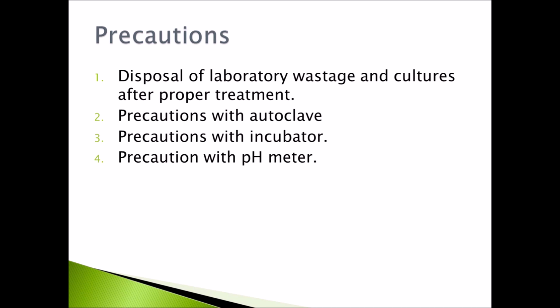Then, precautions with incubator. The door of the incubator should be opened only when required.